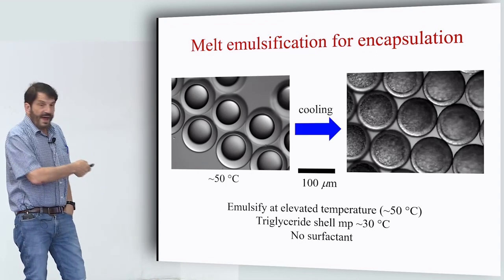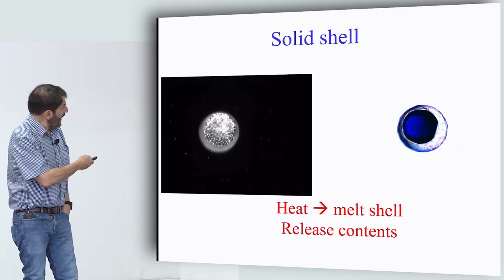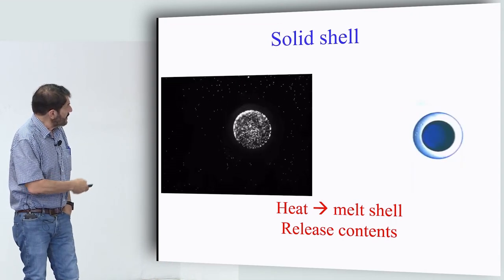And now we can release it just by melting it. So here's an example where here we have some dye inside it, here we have some colloidal particles, and I'll just play this movie as we heat them up.